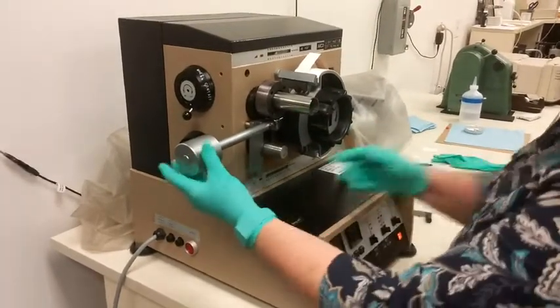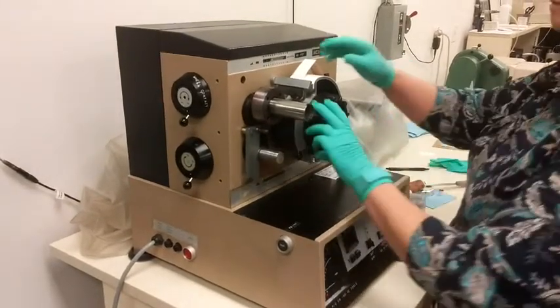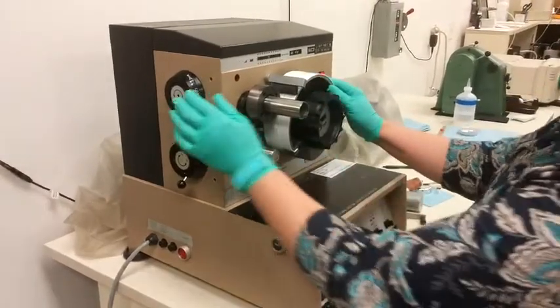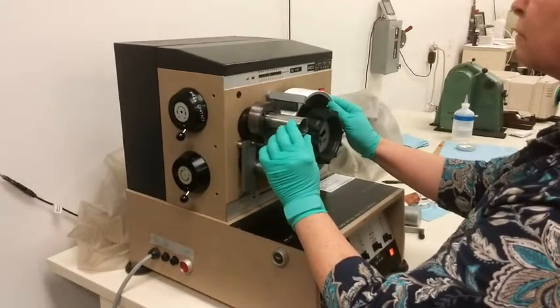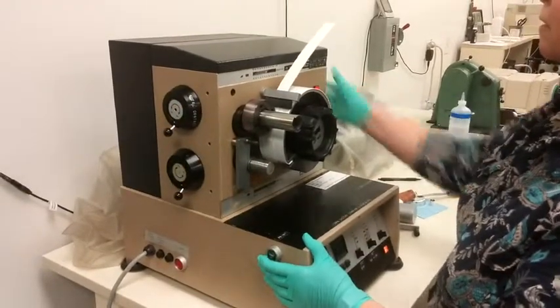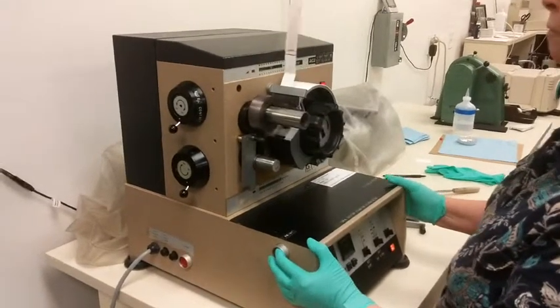The point at which picking and blistering starts is the end point of the test. The reported units for both pick and blister are Viscosity Velocity Product, or VVP. At a known oil viscosity, this value relates to the velocity or press speed that can be achieved before the sheet is damaged.